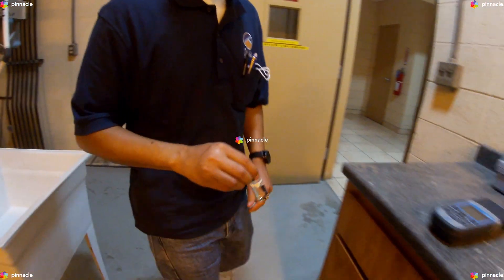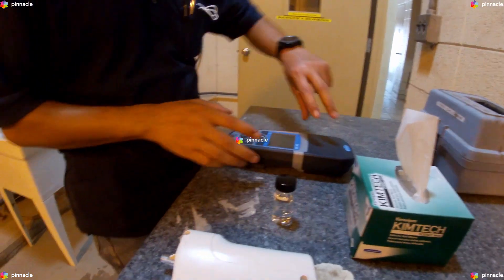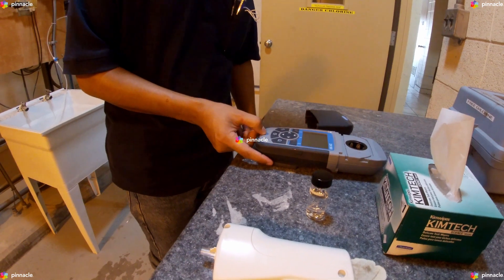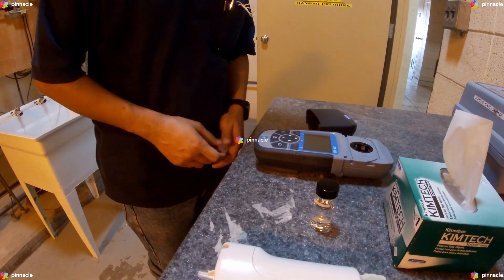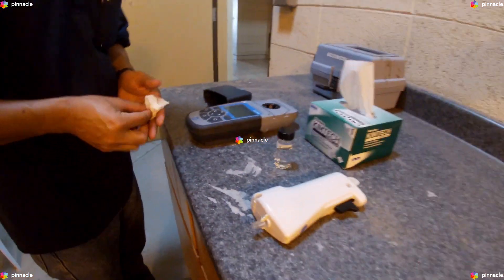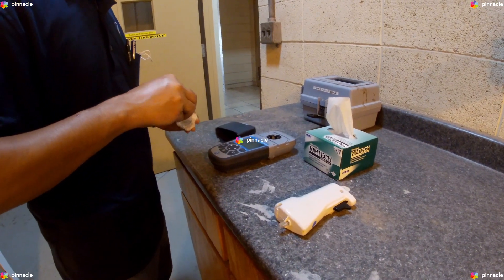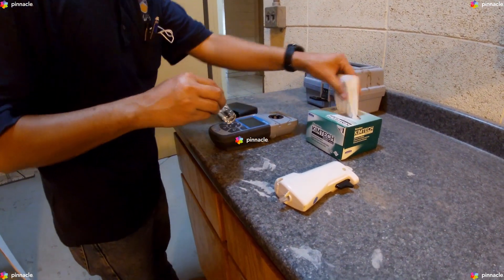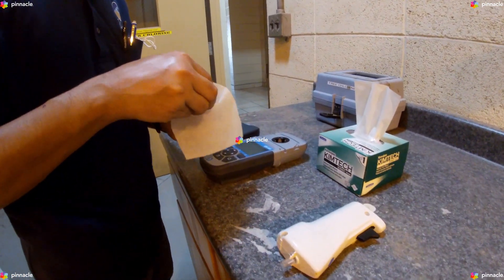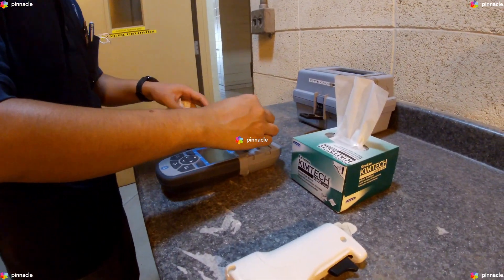We will power on our DR900. We will thoroughly clean our sample cell and insert the blank into the cell holder.